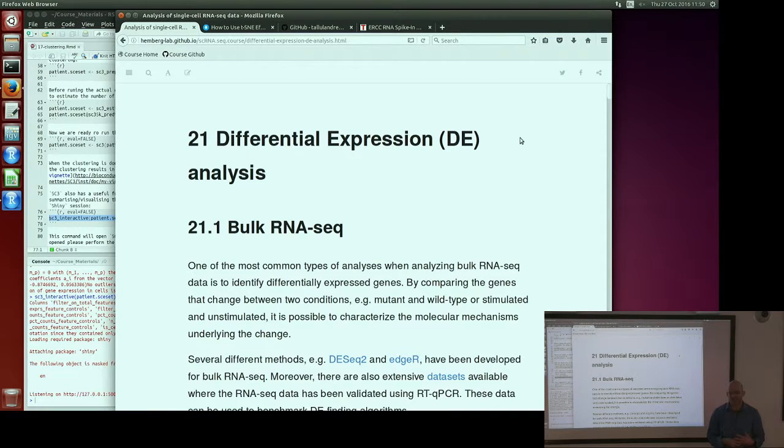it's actually not that common a scenario to have two known samples that you want to compare. Typically what happens is that when you get a sample, it is heterogeneous, which means that the first thing you need to do is either cluster it or align it according to some pseudotime, and then you end up with either a continuum or multiple clusters. So in that sense, it is typically not as interesting an operation to carry out as it was in bulk RNA-seq.